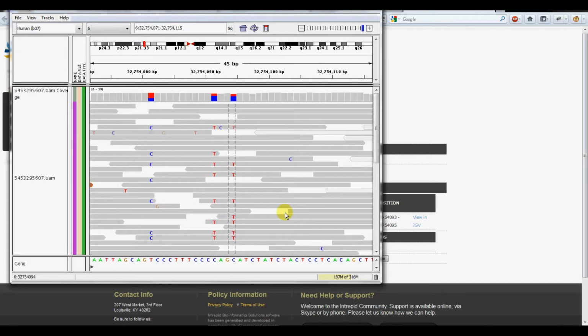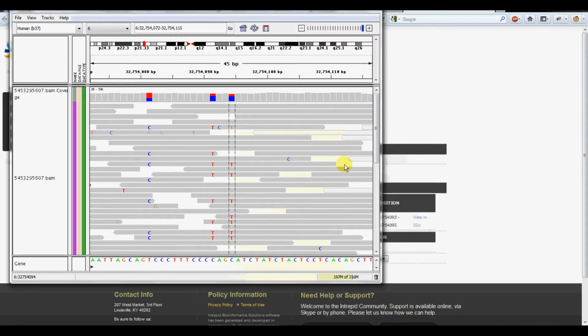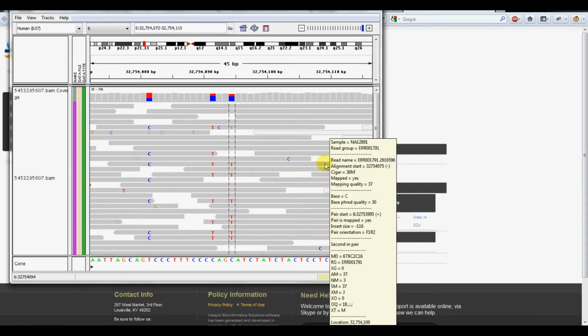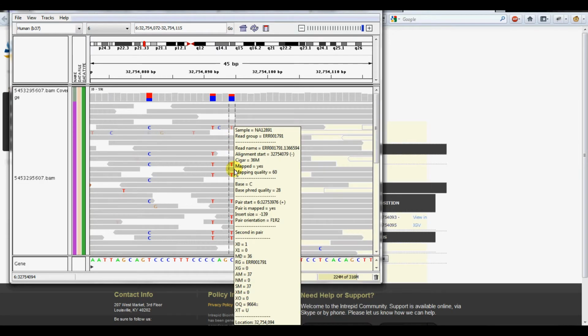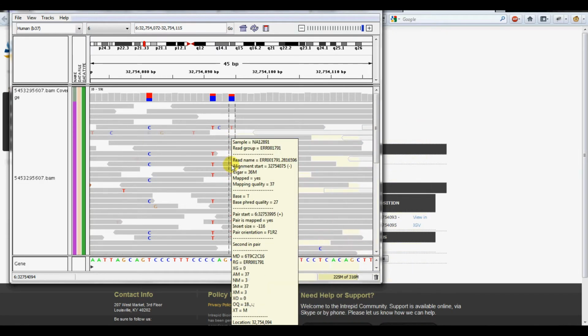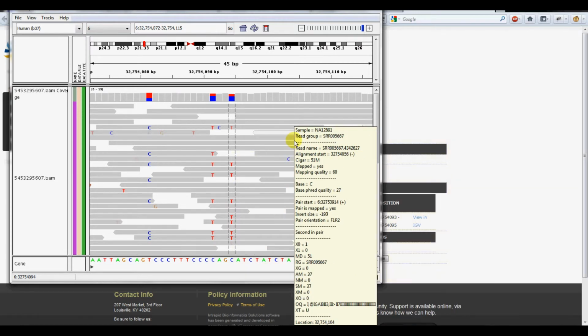We sped up that upload for the purpose of the demonstration, but on a hardwired Ethernet cable, this upload of the 25 or so thousand reads that are found in this region typically takes about 15 or so seconds. What we can see at this position is that the individual is in fact heterozygous CT with high quality base calls there.